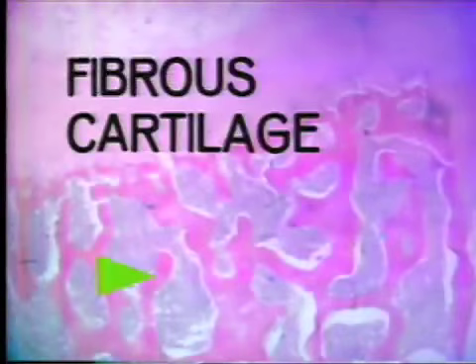Now, let's look at a section under low power of the intervertebral disc area. Down here, this bone. Here's the disc, the fibrous connective tissue disc. That's nucleus pulposus in the middle. And here's the next bone. Now, it's this tissue right in here that's the fibrocartilage. And we'll look at that now under medium power.